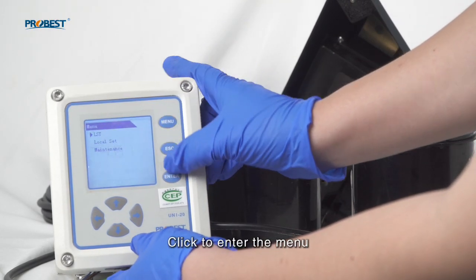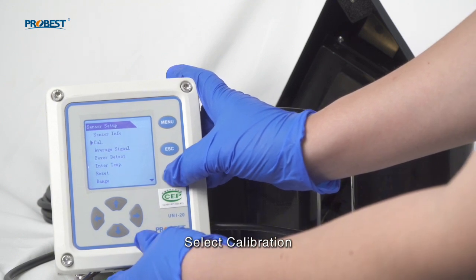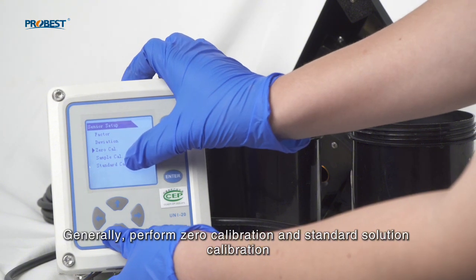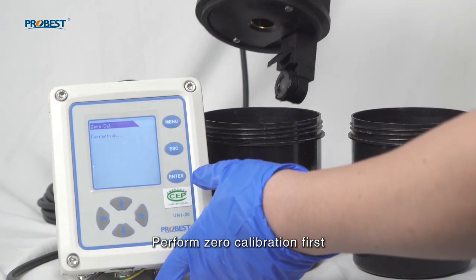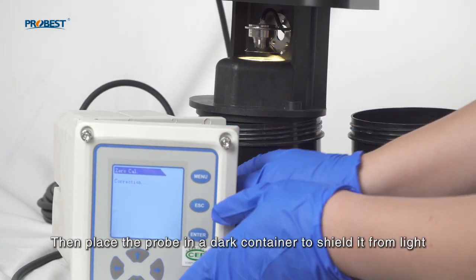Click to enter the menu. Select the low turbidity channel. Select Calibration. Generally, perform zero calibration and standard solution calibration. Perform zero calibration first. Then place the probe in a dark container to shield it from light.